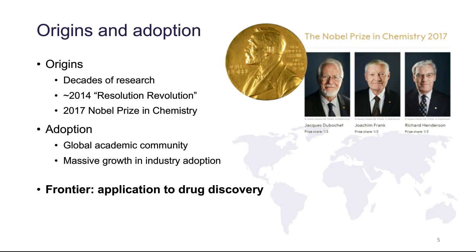The concept of CryoEM was initially conceived decades ago, and at the time was not quite feasible in real life, but through a very strong effort of the academic community and technology development on various fronts, CryoEM underwent a resolution revolution around 2014, and it has since been possible to obtain high-resolution 3D structures of very important proteins. A large global community now drives progress on all fronts, and the pioneering work in CryoEM was awarded the Nobel Prize in 2017. Today, the entire technique is mature enough to be scaling up in usage rapidly, but still many more developments are on the horizon to push the envelope, expand the scope, and make the entire technique robust.